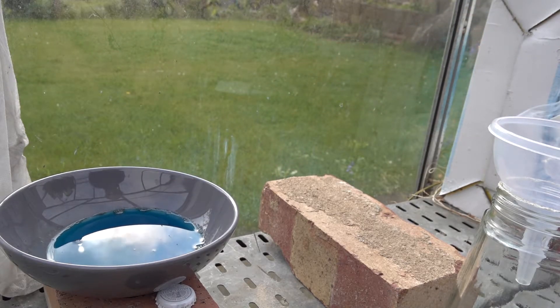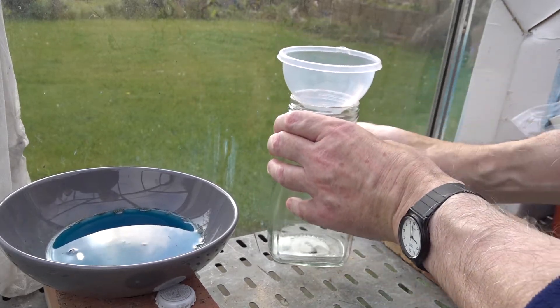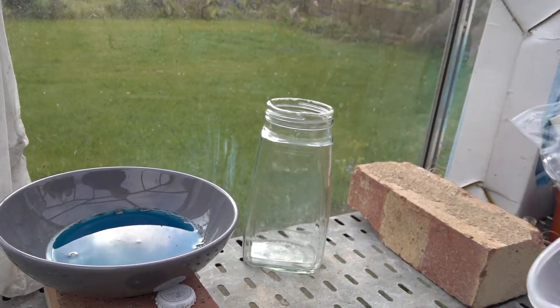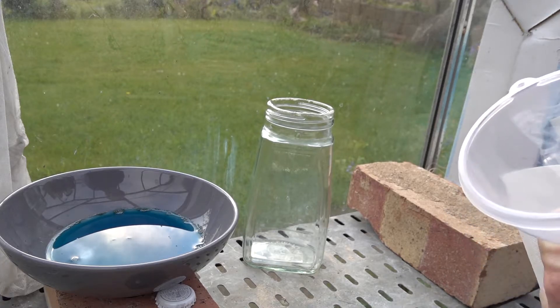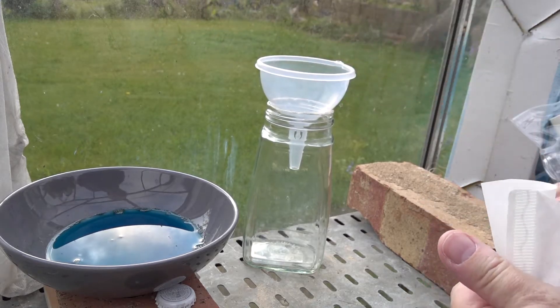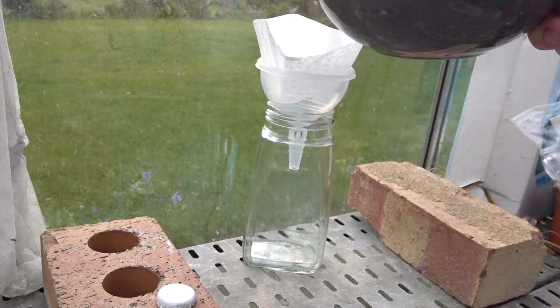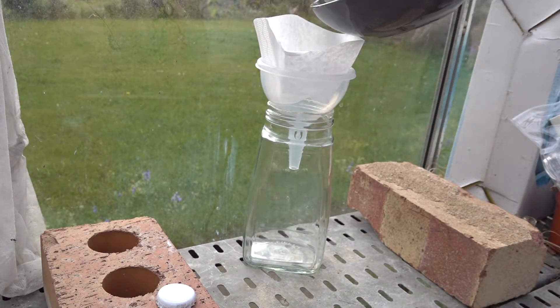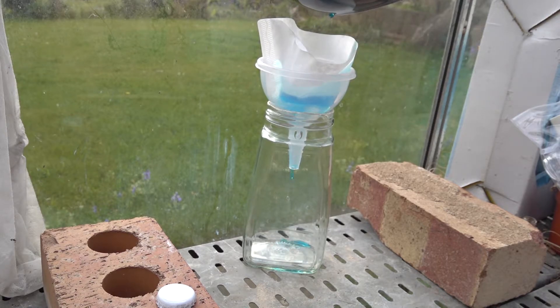In order to filter, we filter into a receiving vessel for the solution. I've got a jar here, we need a funnel, and I'll be using a coffee filter. So there's the solution, and we need to pour that carefully into the filter. As long as it all goes into the filter, we're fine.